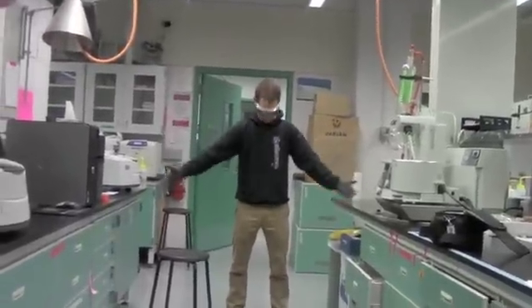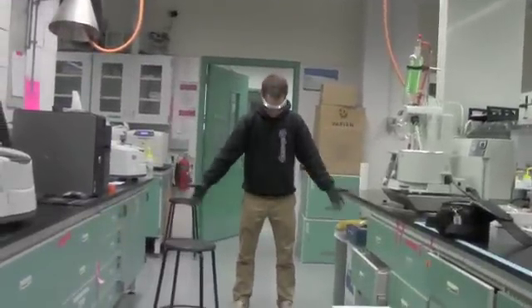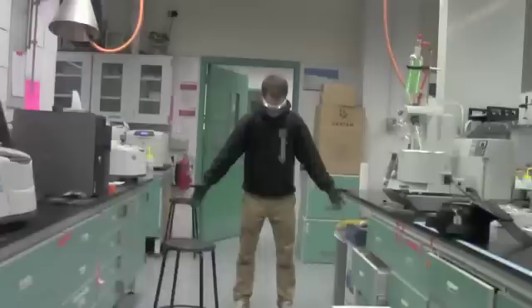Furthermore, when inside a chemistry lab, long pants and closed-toed shoes are required. Tank tops, halter tops, and other items of clothing that leave your upper arms bare are not allowed.